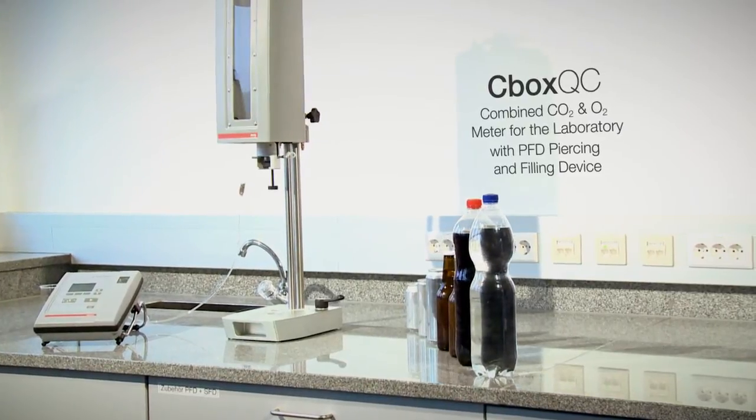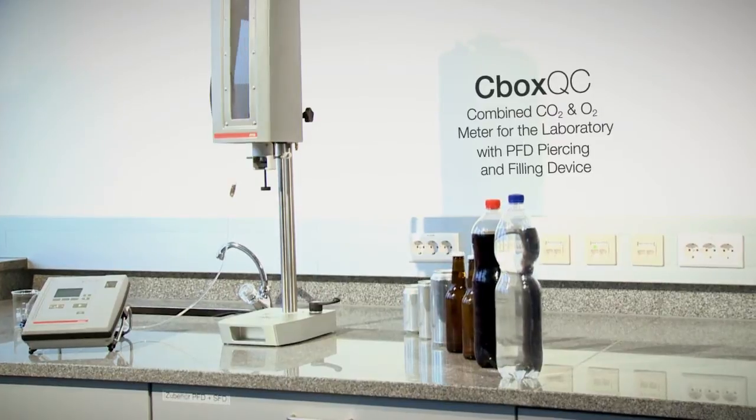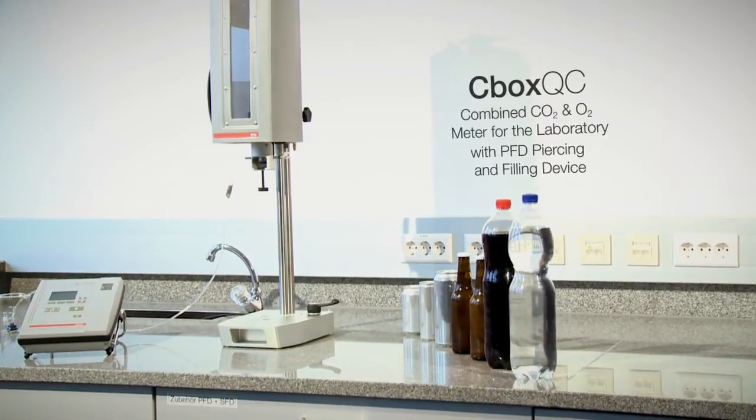This task is quickly and effortlessly solved with Seabox QC, a combined CO2 and O2 meter for the laboratory.